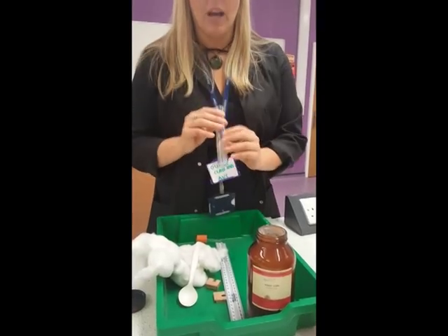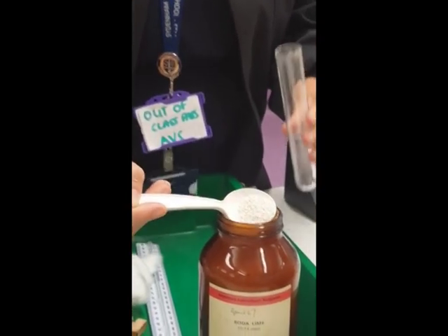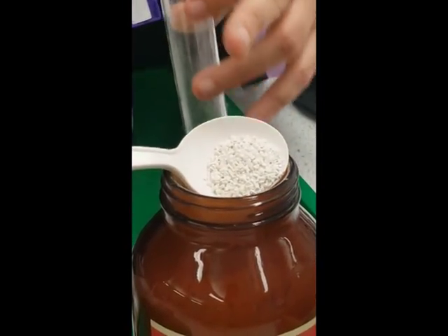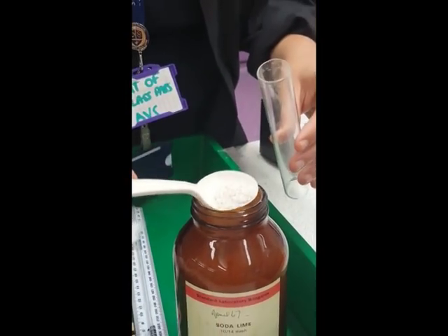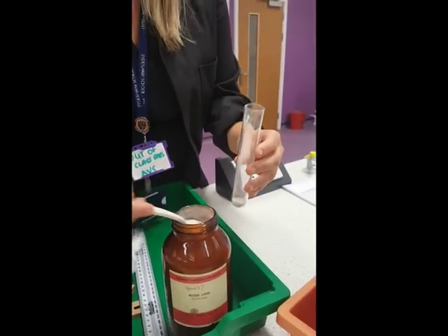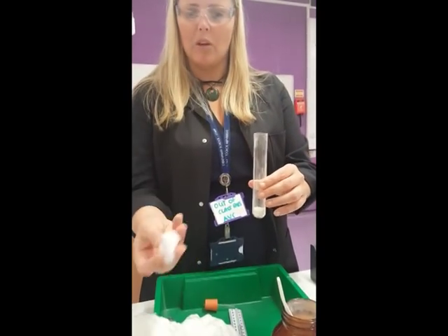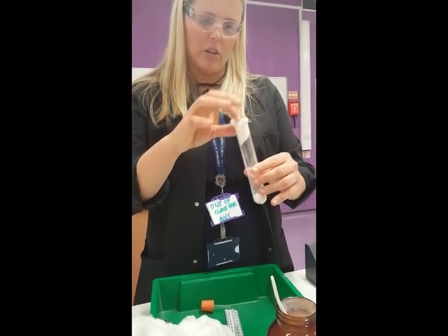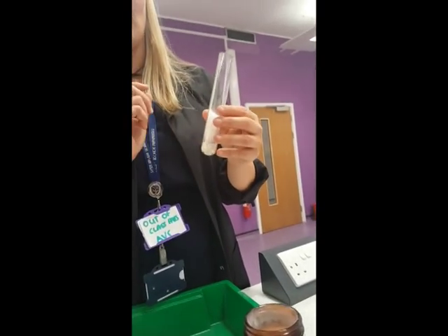Get your boiling tube and put the soda lime in — you need about two to three centimetres. As you can see, the soda lime is in quite large chunks, meaning there's lots of air that can get through. If it were more powdery, the air wouldn't be able to travel around the parts very well. I'm being very careful not to touch it and doing it over the jar in case of spillages. Now I'll put a bit of cotton wool in the top and push it down using the other end of the spoon. You don't want the cotton wool packed too tightly or the oxygen and CO2 won't move around enough.